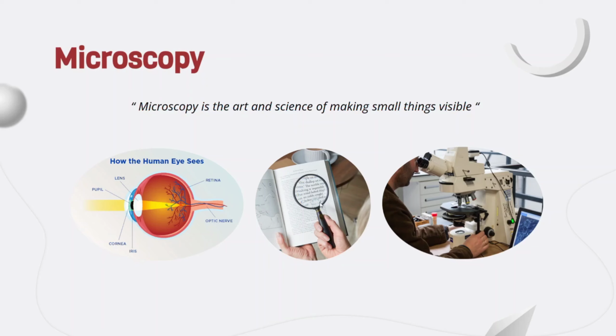So what is the solution to see more details? We can use a magnifying glass between the eye and the object to make things appear larger, but this effect is limited. It is not possible to obtain a magnification greater than 8 or 10 times. So if you want to see more, you need to use a compound microscope.